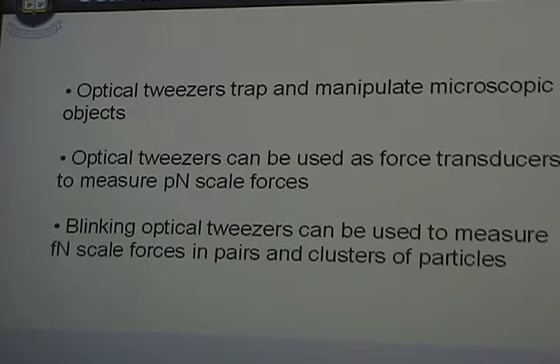So that was sort of a whirlwind tour of what optical tweezers can do, and some very different examples of how you can use them to do science. The first example was very purely biological, trying to understand how cells move with a piconewton scale force, and there a simple force measurement where you just relate displacement to force works great. But we also use optical tweezers to measure much smaller forces in thermal systems and to do basic physics experiments.